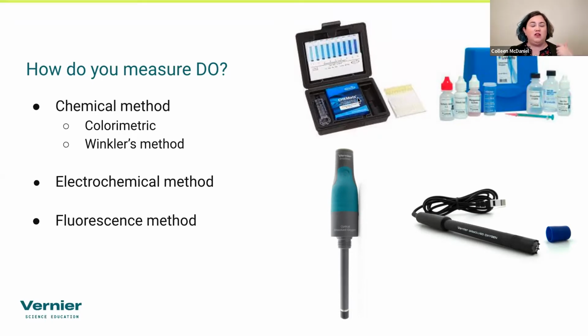So I was constantly going through them. And I mean, they usually come with 10 or 12 ampules, and I could go through one set of those in a class period easily. So it gets really wasteful. And then the cost of replacing them seems low, but cumulatively definitely adds up.